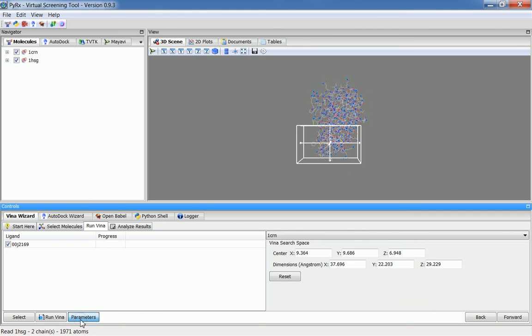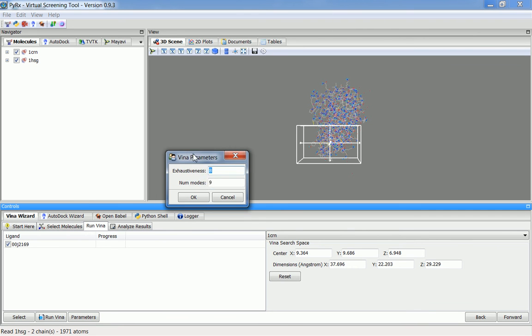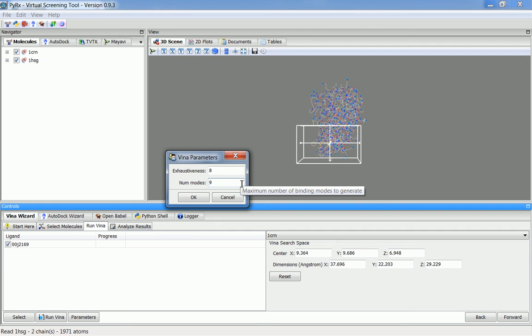New in this release also is an option to select parameters for Vina. Here, I've just added, besides exhaustiveness, number of modes. Some of the users wanted to see fewer number of modes in the final docked confirmation.